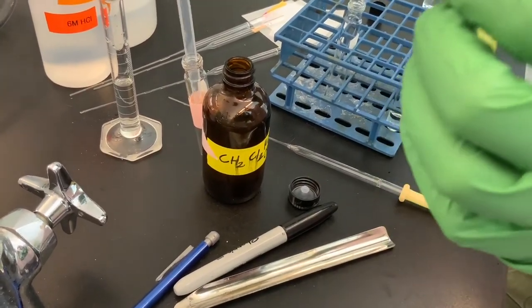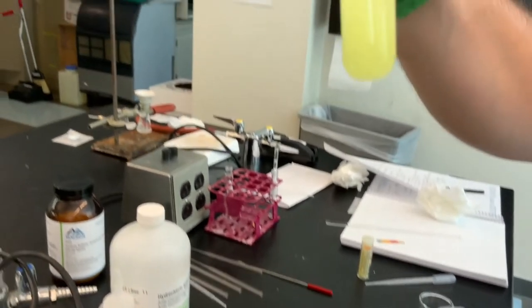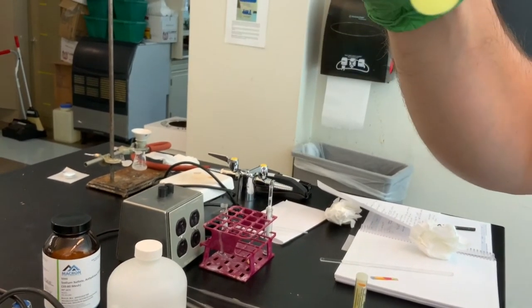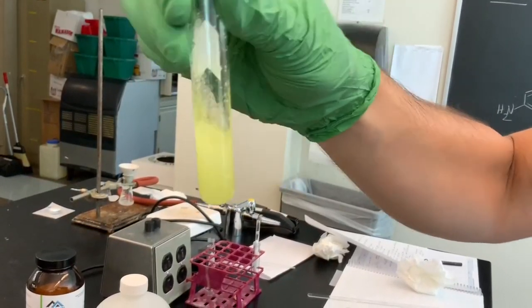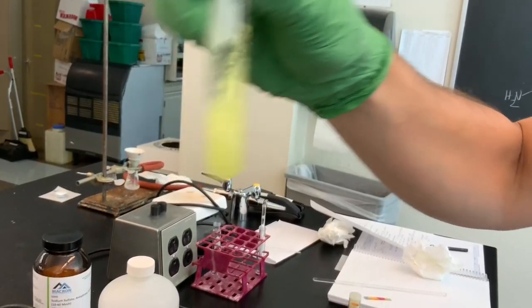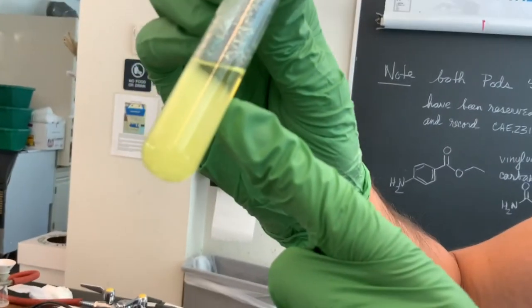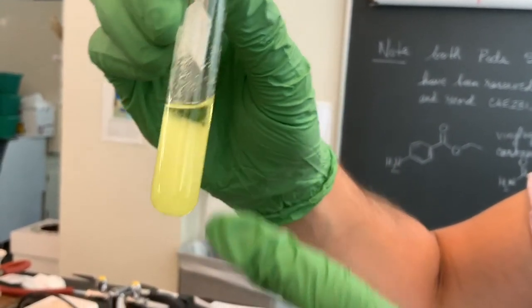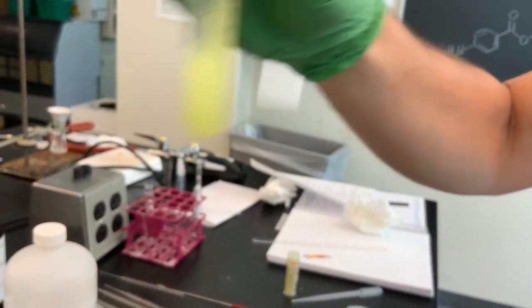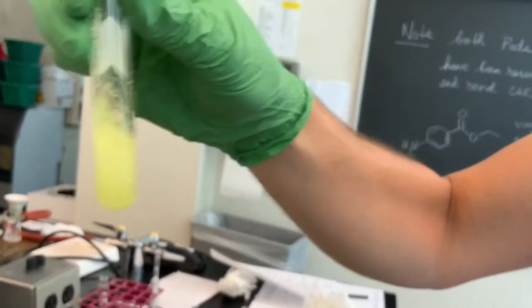So we can see something. All right, a lot of sodium sulfate in there, but at least some of it is free flowing. So why don't we go ahead and just say that's the snow globe we're looking for, and we've dried it the best we can. The organic layer, if you look at it edge on, has definitely cleared up. So that means we've definitely gotten rid of most of the water. And so we're gonna just let this sit for a little bit and let the sodium sulfate dry the organic layer a little more, because it does take some time.